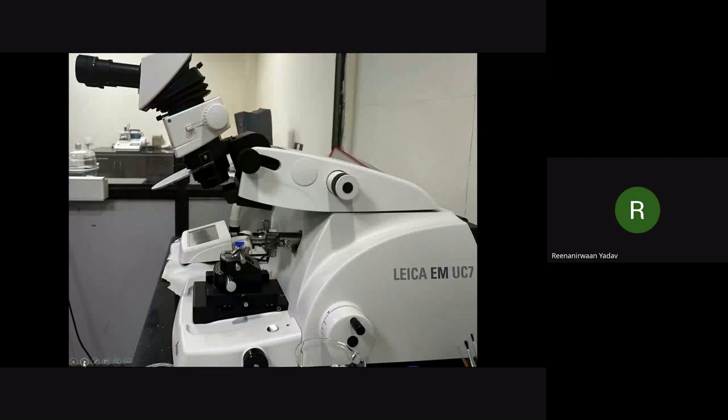So this is the picture of our instrument that we have in our laboratory, the EM UC7. It also has the cryo attachment. So here we can also do the cryo section. Next.